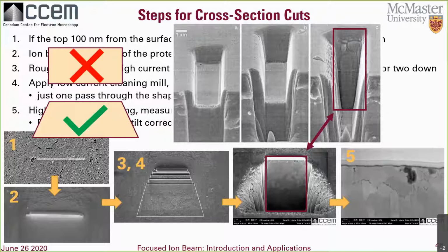I don't have that problem here because I use trapezoids instead of rectangles, even though my trench goes twice as deep as that example. You can see there's redeposition along all the three other side walls of my trench, but it's out of the way.